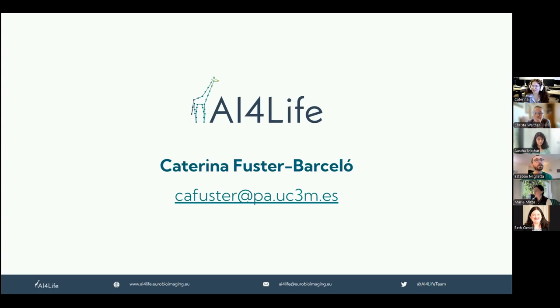Okay, I have not tested it. I don't think about channels, but I think you might be able to try it, mounting it with different images. Maybe it's not batch processing, one after the other, but you might be able to do it over all of the images if they are not a lot. This is done in the browser, so it won't have the capability of a GPU, for example. Yeah, that was actually one question of mine that I can include here: is there any limitation on the size of the images that we can mount? Not that we have faced, but of course, for sure, there is.